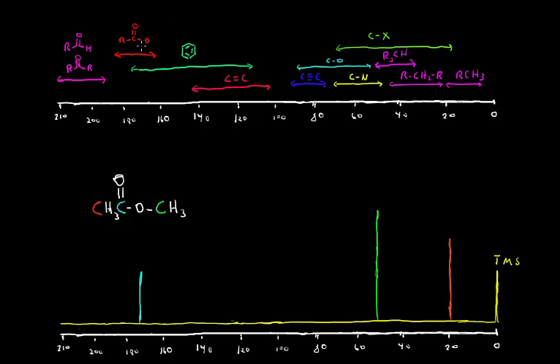Esters and carboxylic acids, that's the carbonyl carbon, are even farther downfield because they're not only de-shielded by the pi electrons, they're de-shielded by these electronegative oxygens. And esters and carboxylic acids, the carbonyl carbon in those generally resonates in the region of about 160 out to about 185. Ketones and aldehydes are really the farthest downfield. We're talking again about the carbonyl carbons, and those resonate between about 190 and about 210. Usually if they are saturated, that means the alkyl groups coming off of these things are saturated, they're lower field than 200, from about 200 to 210.